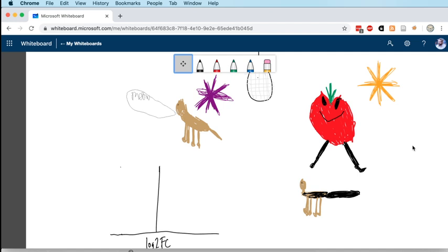So clearly the x-axis is going to center around 0, and we're going to have upregulated genes and downregulated genes represented on it. And then on the y-axis of our volcano plot, we're going to have a representation of the adjusted p-value.